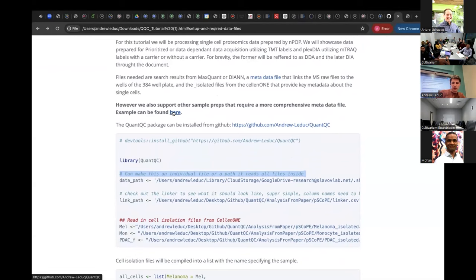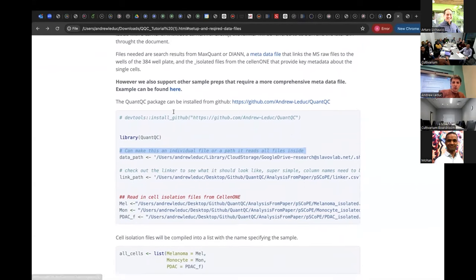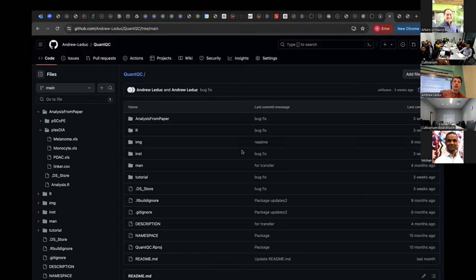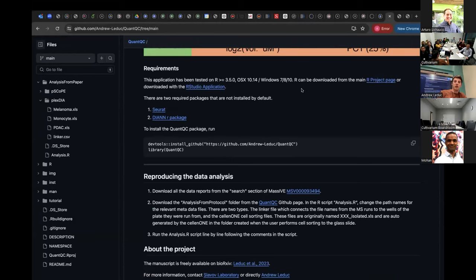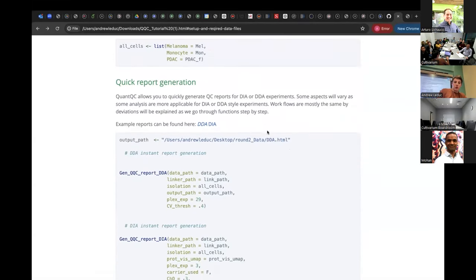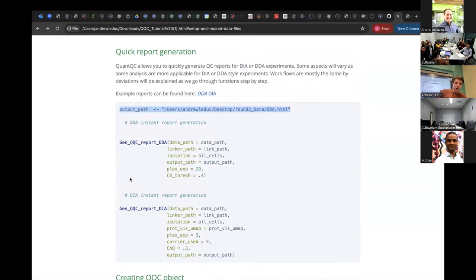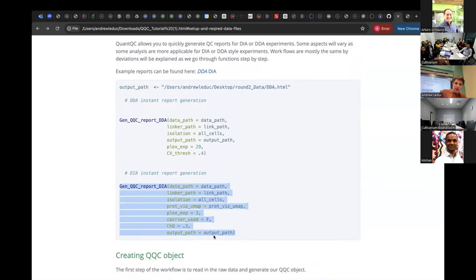And there's some links additionally here. So it has the information as well for installing the package. I didn't talk much about that. Hopefully it'll be part of something more official one day, but for now you can just use devtools to install from GitHub and just type the link of the repository and it should install for you. There's a couple of dependencies. They're listed. You can find all the information here. If you include an output path, so where you would want the file to be generated, you can generate these reports, which hopefully will be useful to you.